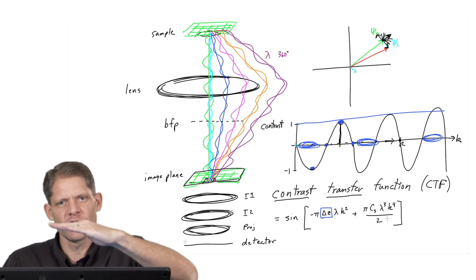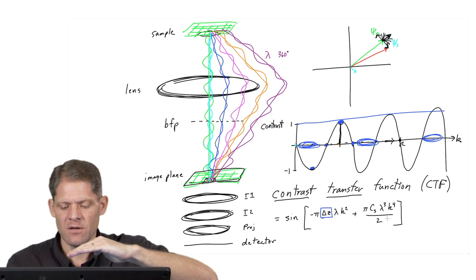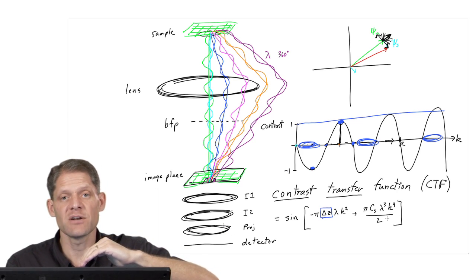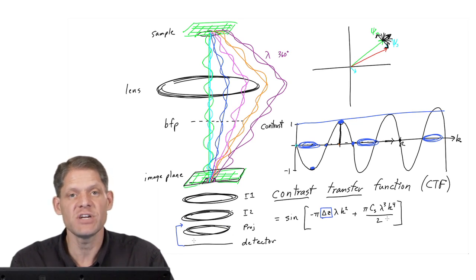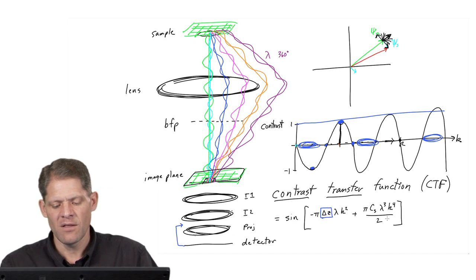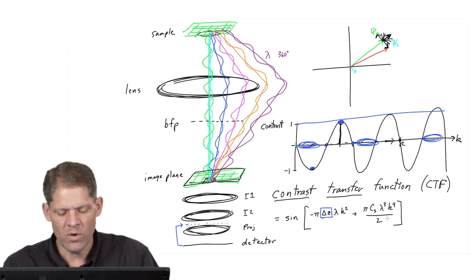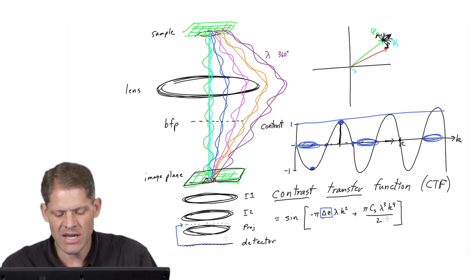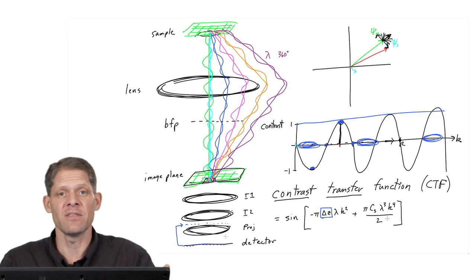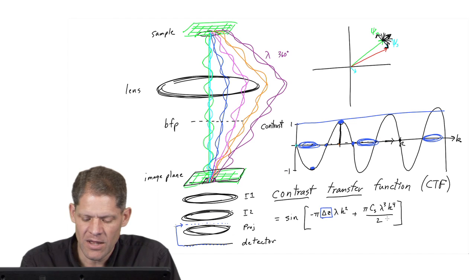Because the detector is screwed into a particular position within the microscope, and given the current going through the projector lens at any given time, the detector will be conjugate to some plane above the projector lens, meaning the same wave function that exists on this plane will also exist on this plane along the detector, except it could be magnified by the lens. But the wave function is the same. And so these two planes are conjugate.